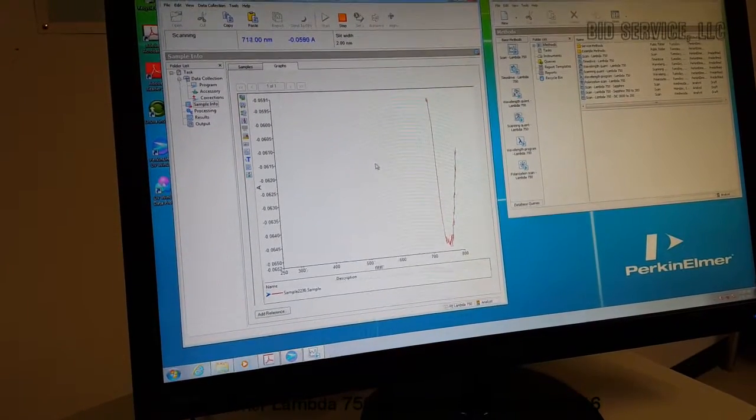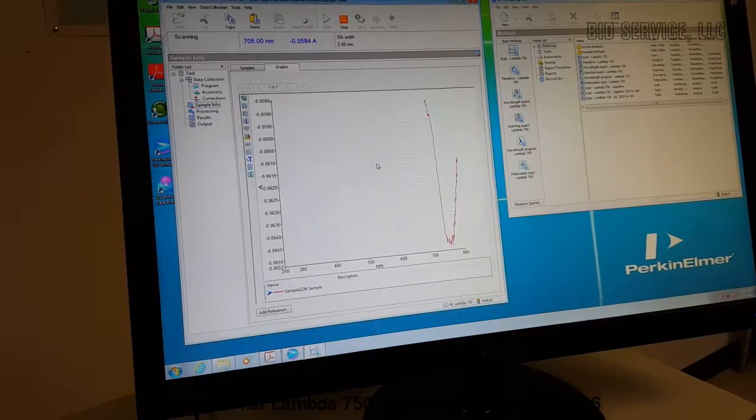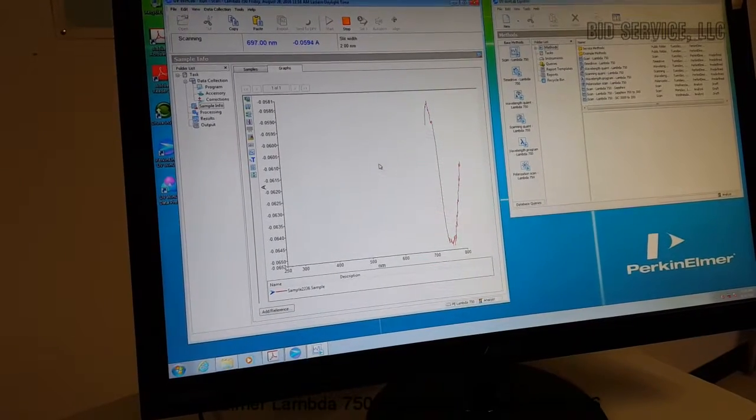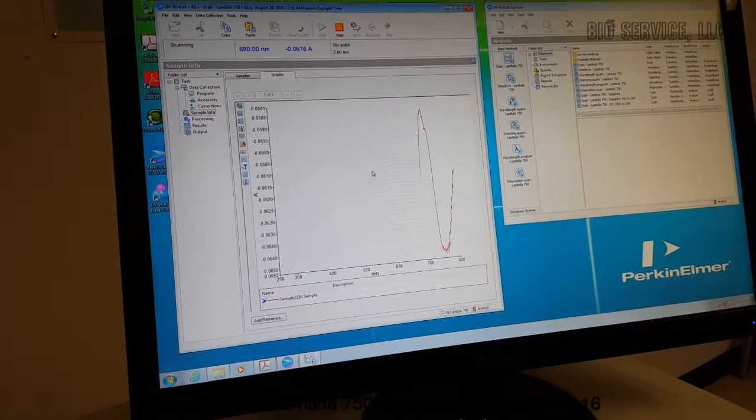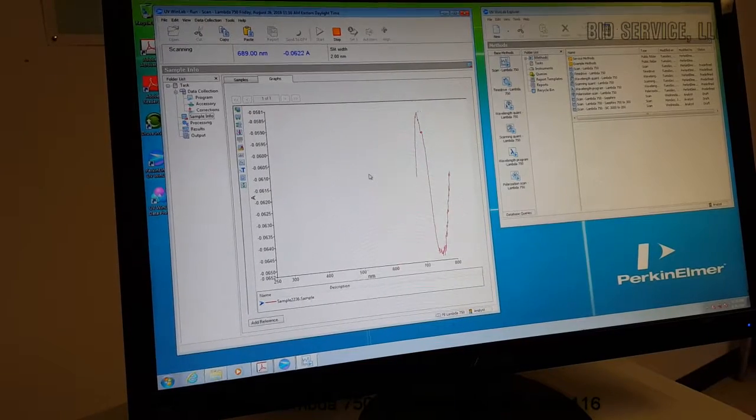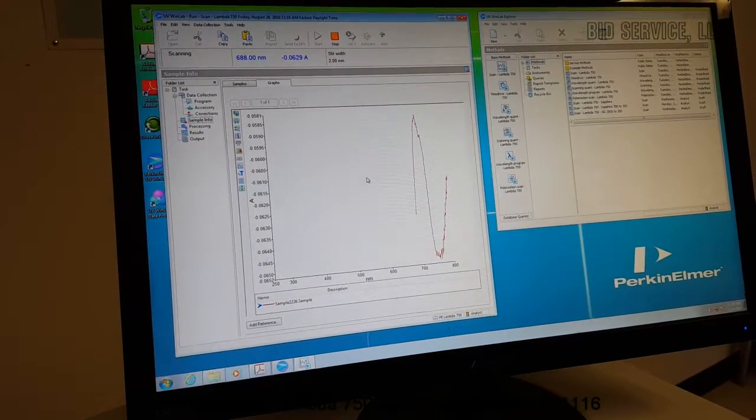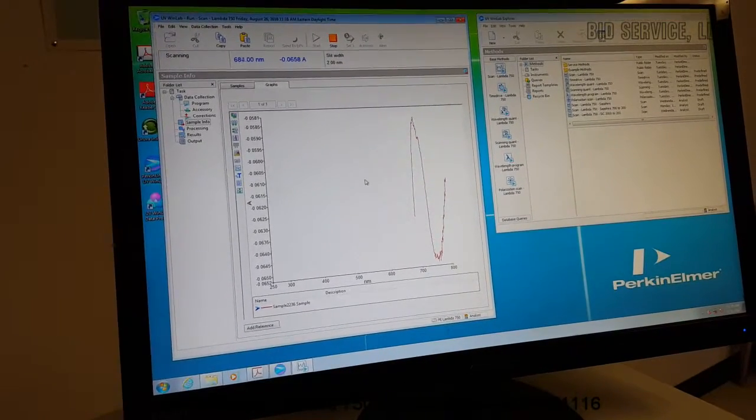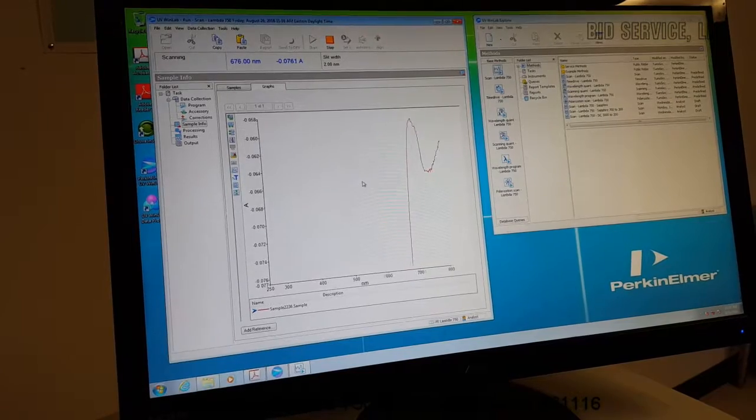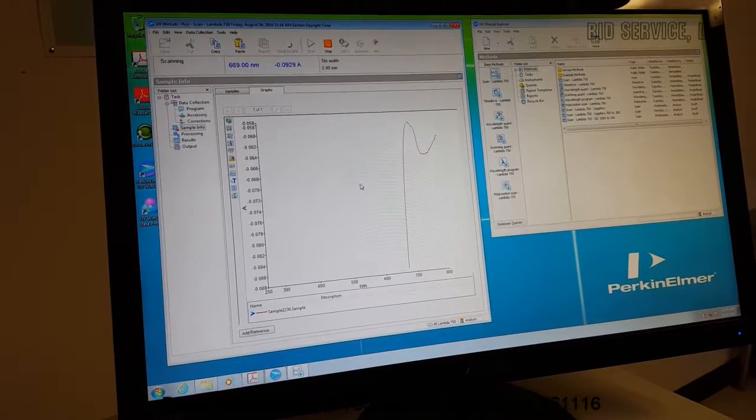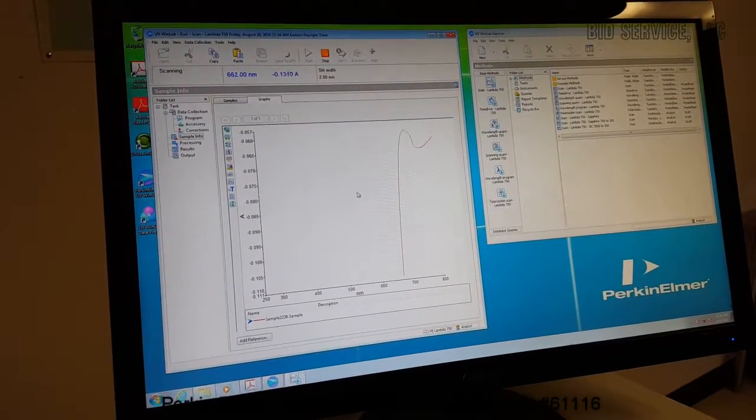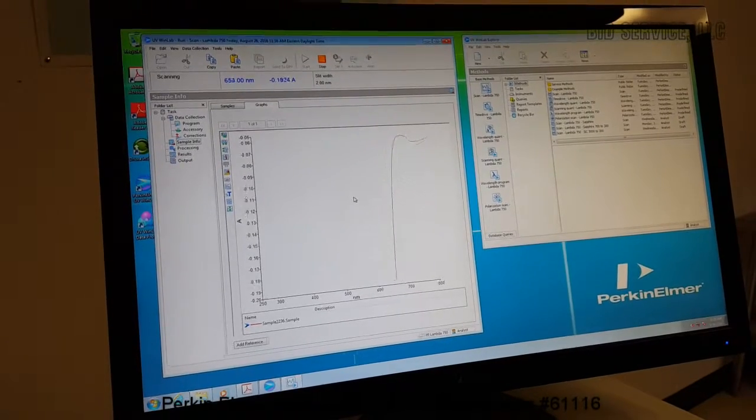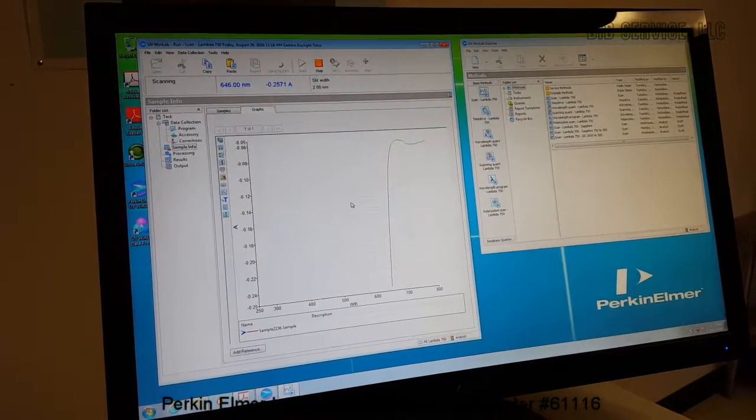I'm using a liquid soap sample just to demonstrate that the system is responding. The unit has built-in calibration routine, and the unit did pass the initial wavelength calibration routine.